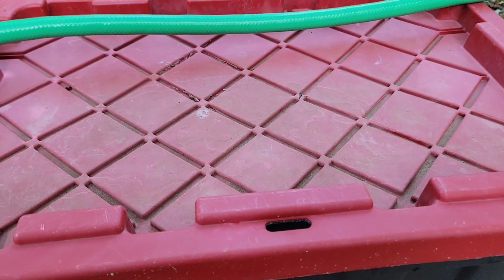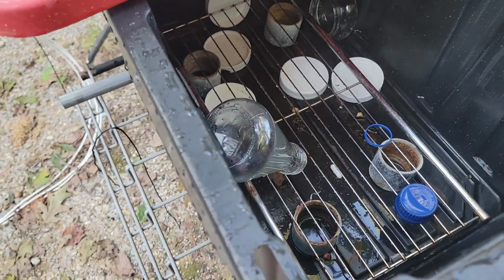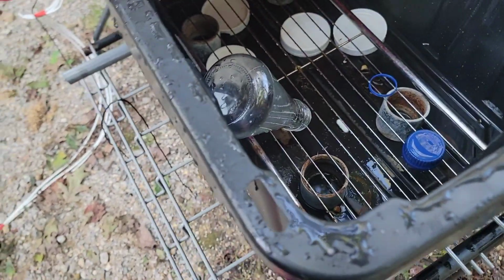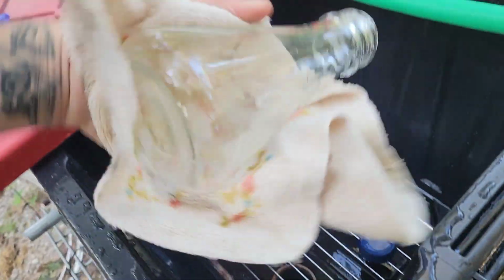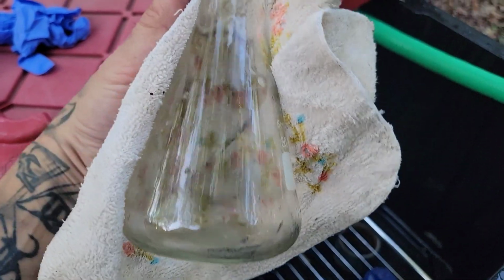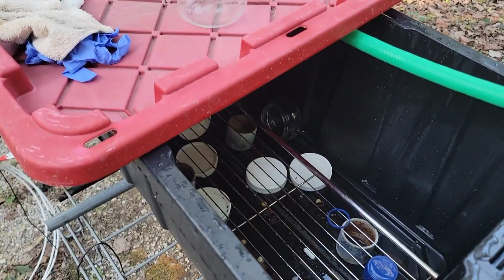What are we cleaning? Right now I just have my old media flask in there, my old Erlenmeyer flask from some old agar. Just wanted to clean it out before we use it. Throw it in there, let it steam. Cleans everything out of the inside nice and neatly for me. What else can we use it for? Great question.